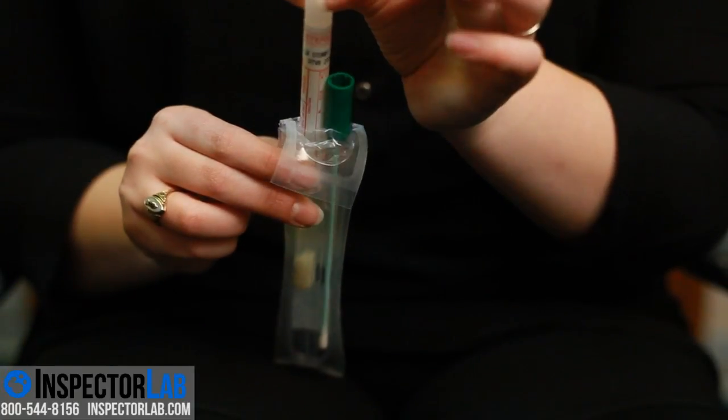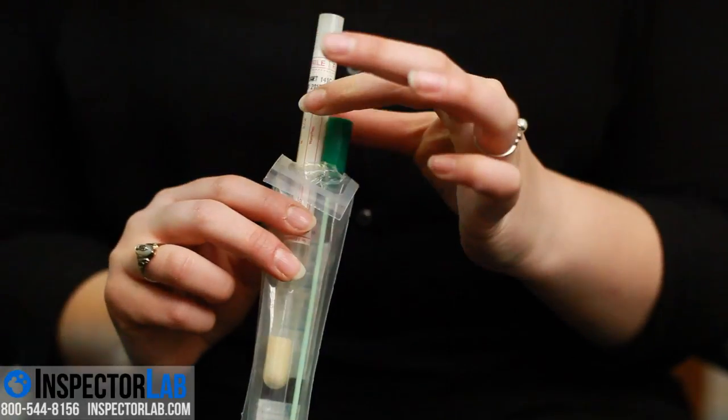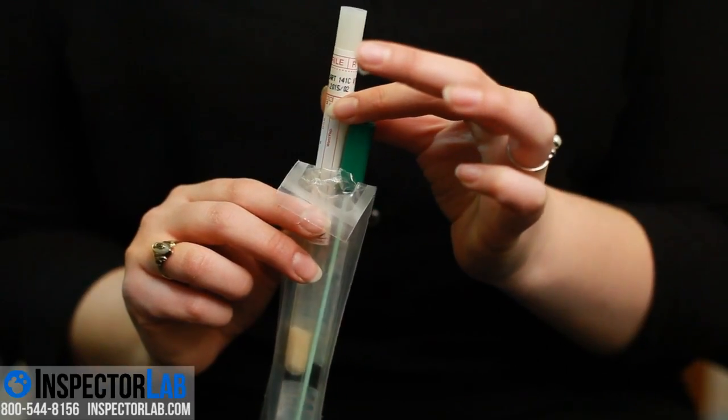Mold from swab samples is normally not counted because the counts are meaningless. A swab sample is not used in the same way each time, each surface is different, and the area and pressure used to collect the sample varies.